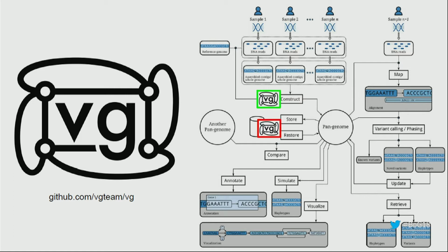Then, in order to operate on them at scale, it's not enough just to keep them in textual format. We need efficient indices that let us look things up, so sequences and haplotypes. And then you can leverage these indices to map reads or new sequences into them. And that's, of course, the basis of resequencing analysis, a way to do out-of-core analysis in large data sets.